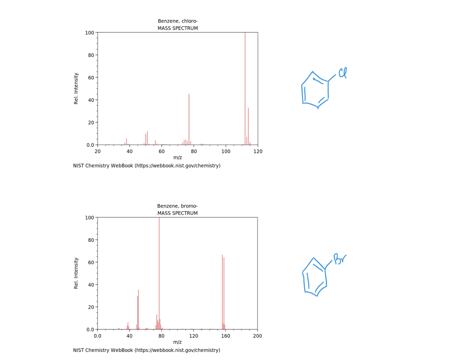We're also going to look for things like methyl groups that can come off, as well as any major groups. Like in this case, we've got benzene in both of these. So keep in mind what's happening with the mass spectrum. In this case, these are electron ionization. So what we're doing here is bombarding a molecule with electrons and watching how it falls apart.